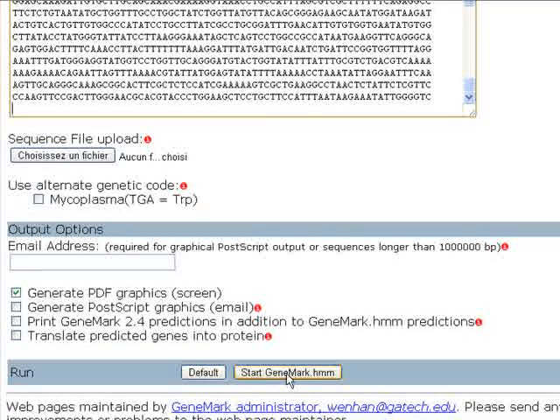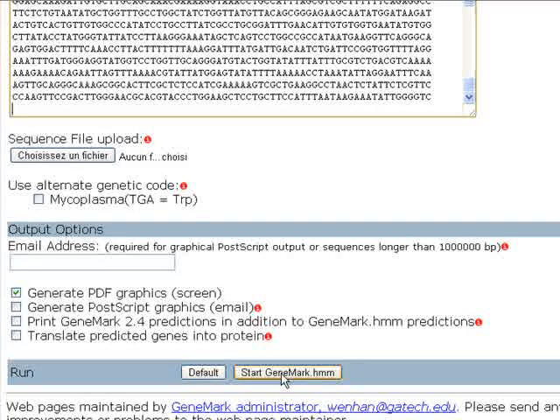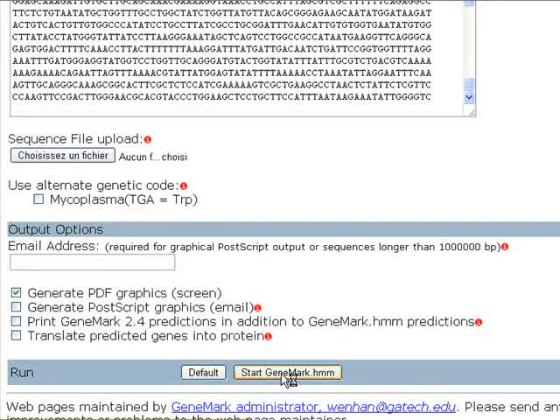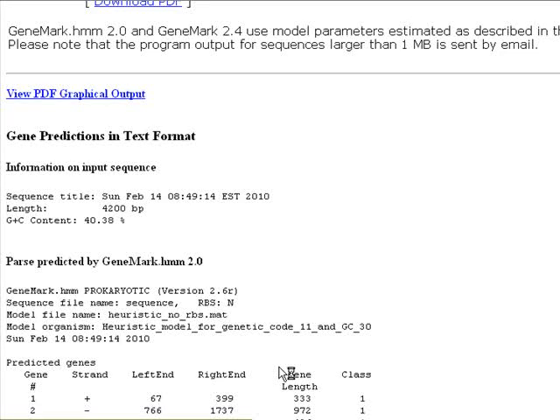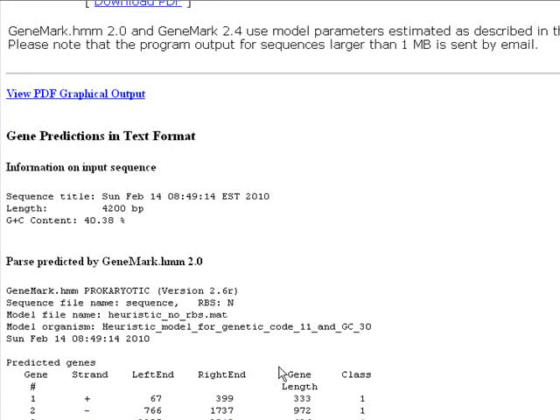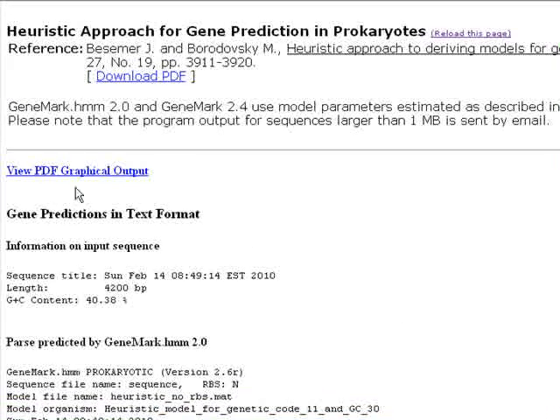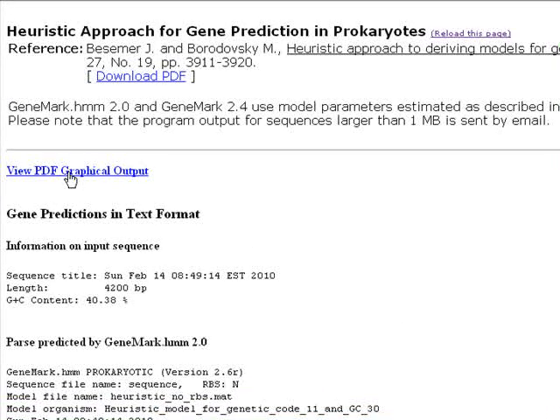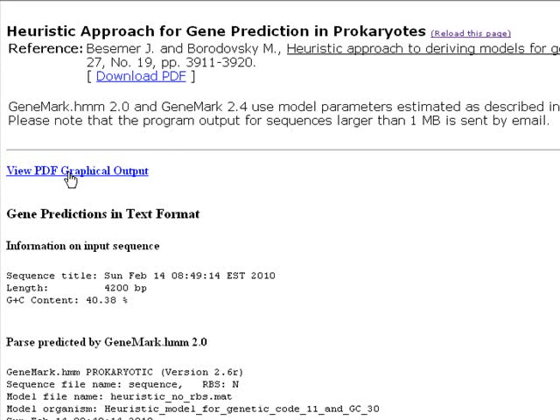To start the program click on start GeneMark.HMM and we wait for the result page to appear. This is a very fast software so we can click here to download our PDF graphical output which I've said is very useful.